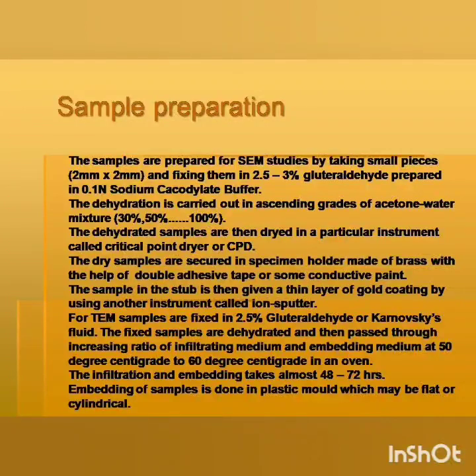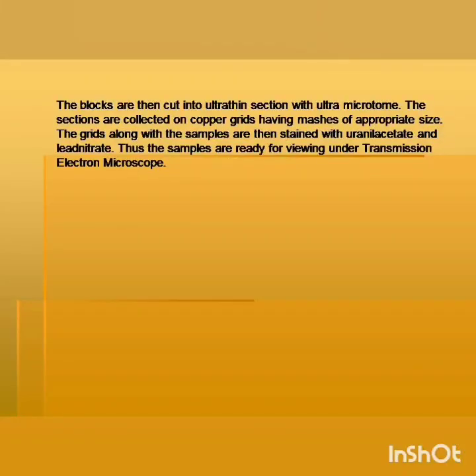After that, the sample has to be coated with gold in an instrument called ion sputter.